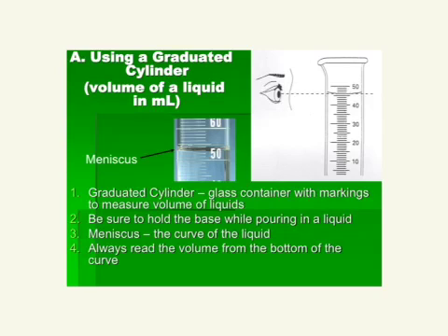So let's take a look down here. It says a graduated cylinder: glass container with markings to measure the volumes of liquids. Be sure when you're actually measuring or pouring that you hold the base of your graduated cylinder when pouring liquids. That way it doesn't spill over.